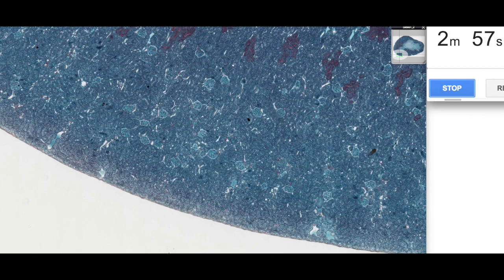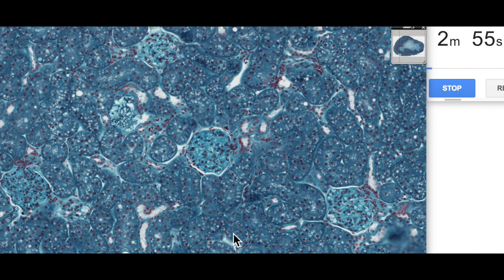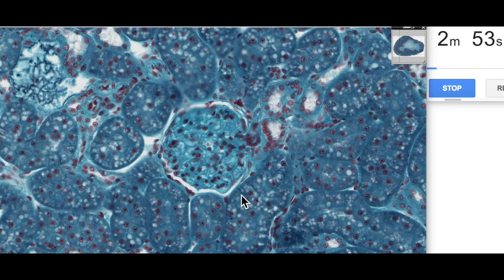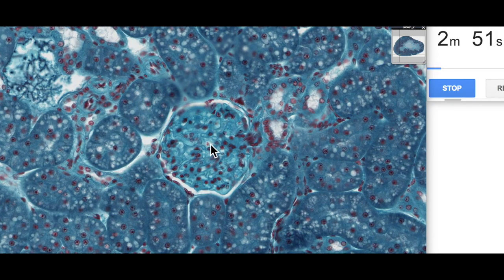If we zoom in on one of these renal corpuscles, we can have a look at a bit more detail. Here's the renal corpuscle. Scattered around we've got our proximal convoluted tubules, a couple of distal convoluted tubules here, and something special going on here called the macula densa, which we'll talk about in a little while.